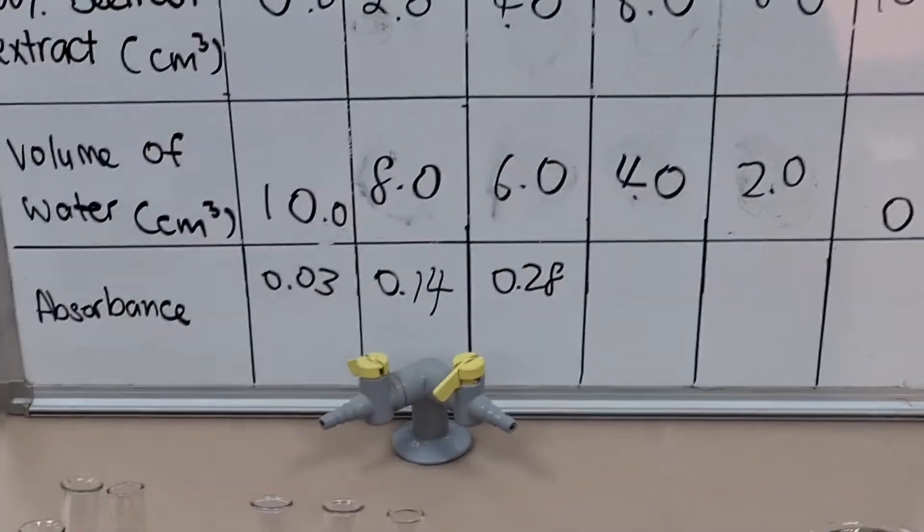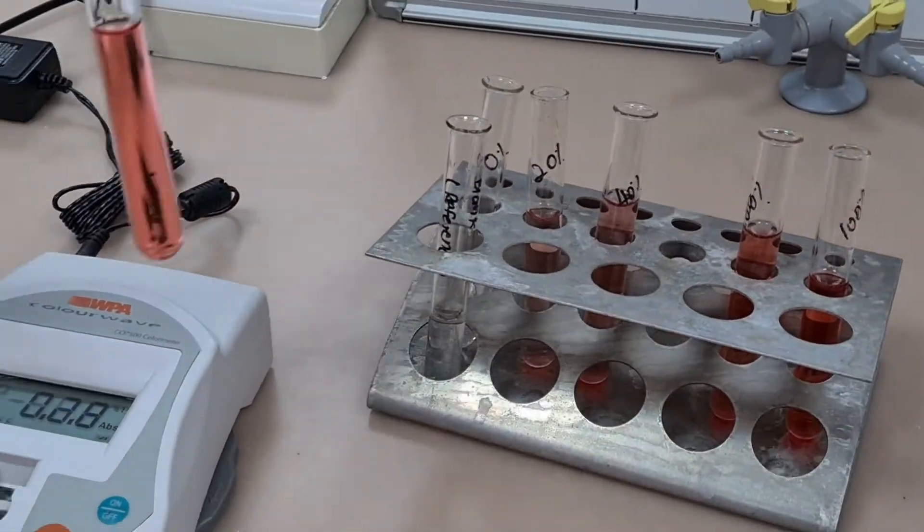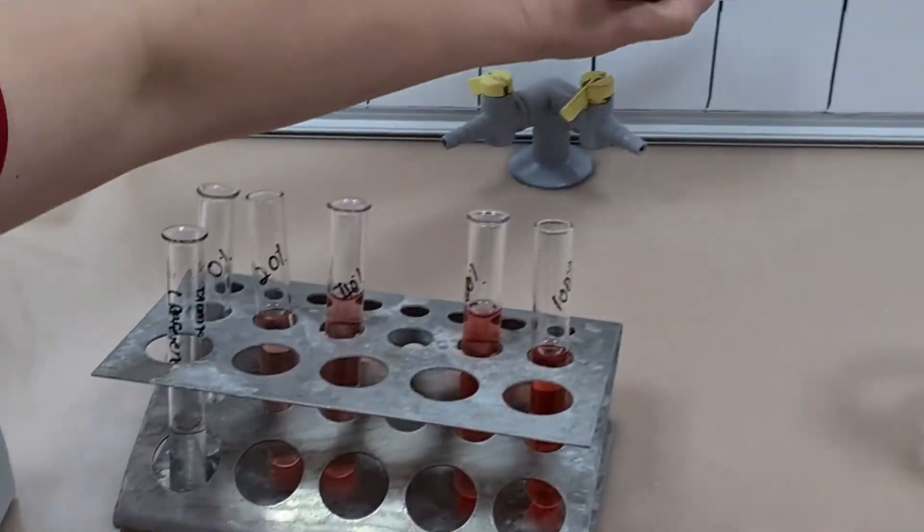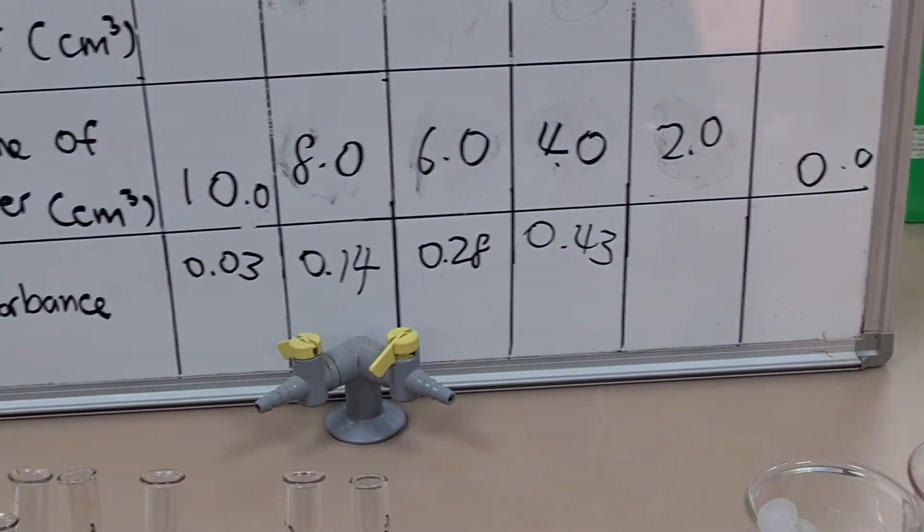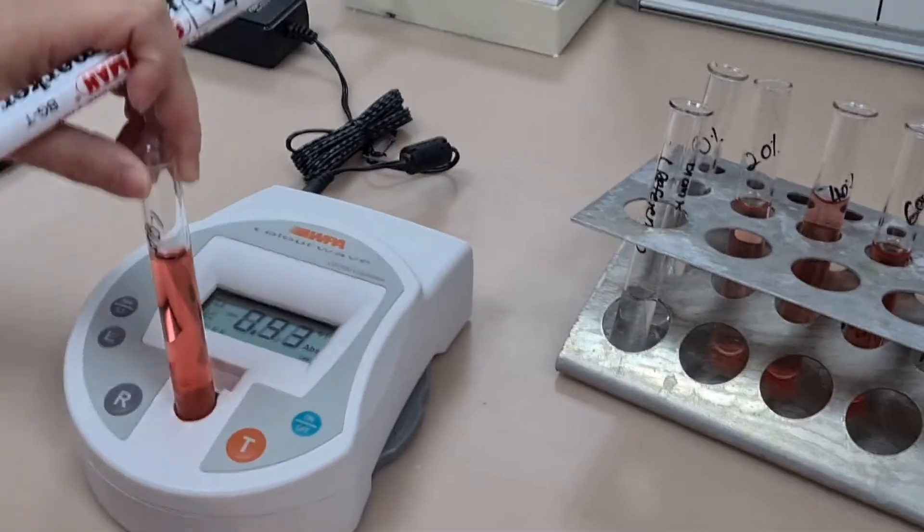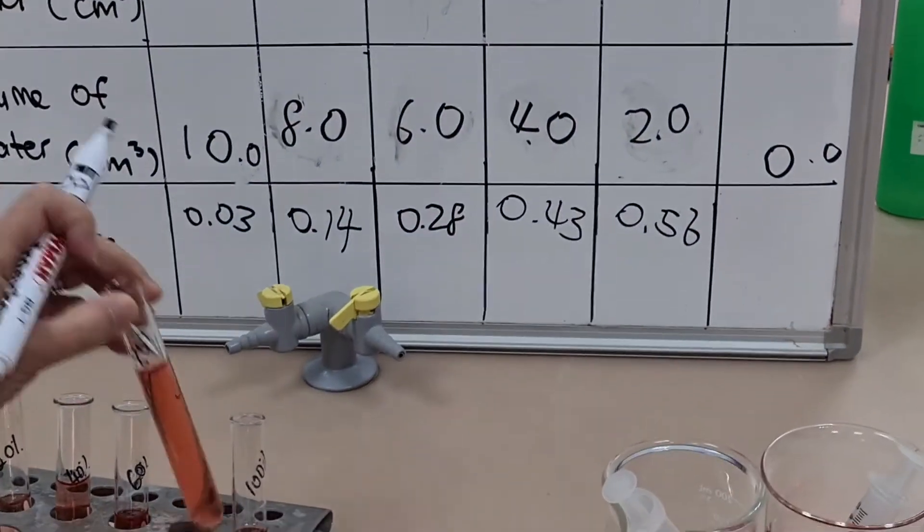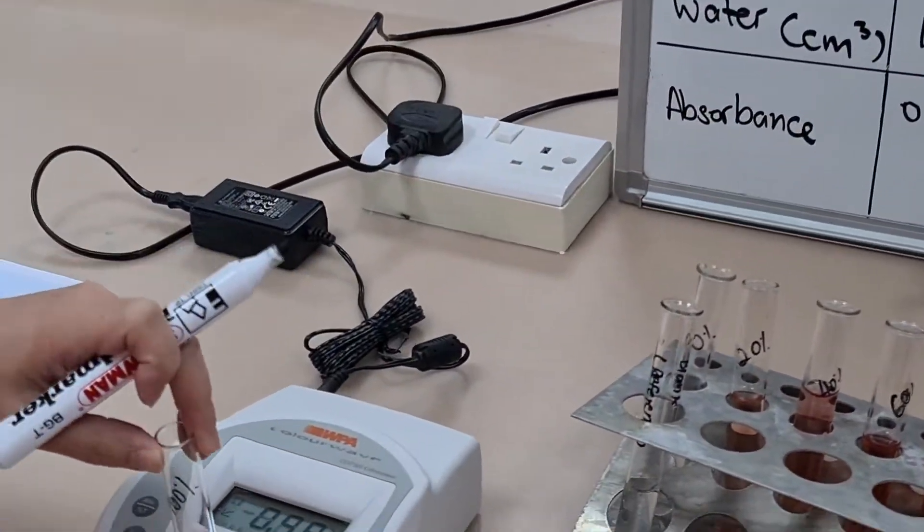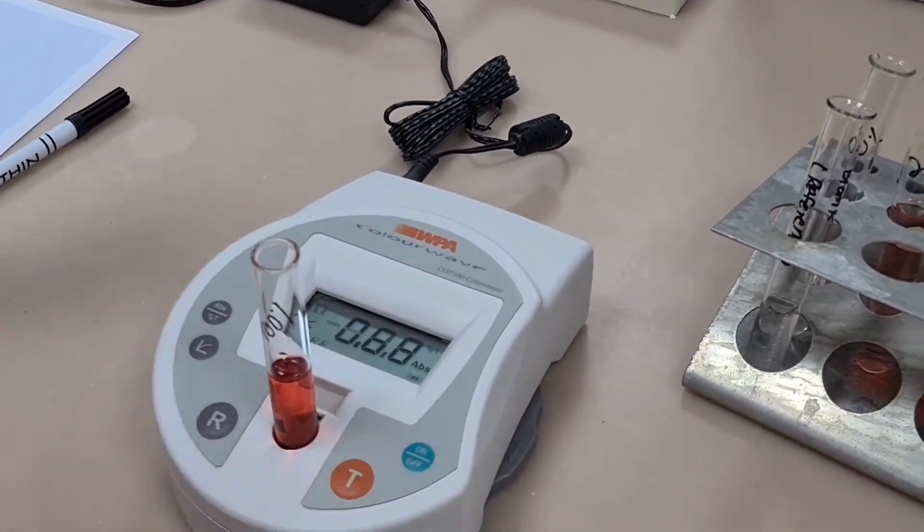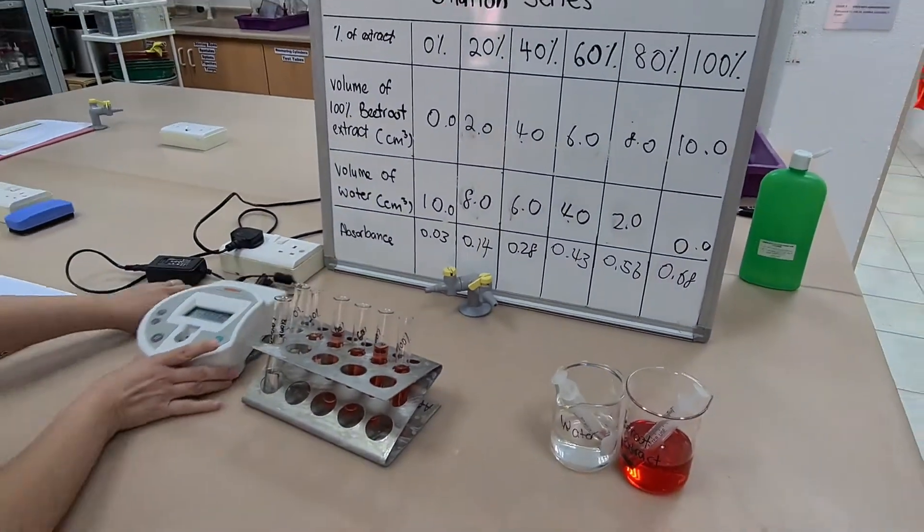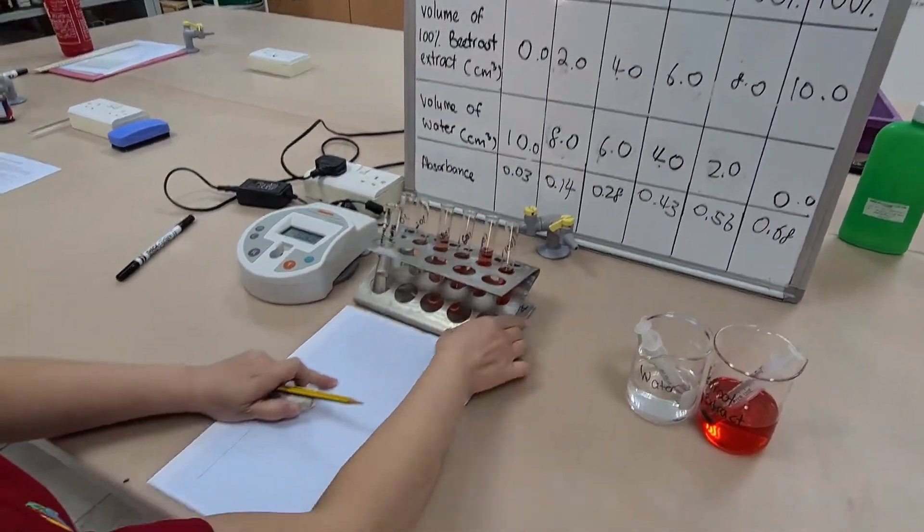And in between measurements if you want to you can reference it again, you can tare it, you can put your sample of water back in and press the R and make sure that each time you remove one of your samples it returns to zero. So here we move on to some of the more concentrated dilutions and you can see that the absorbance is actually increasing. In other words our extract is absorbing more of the light.